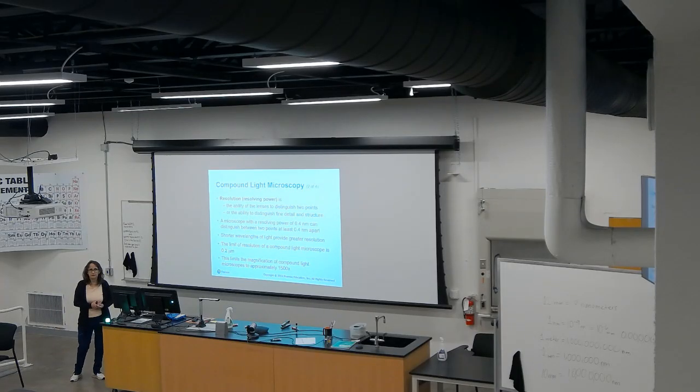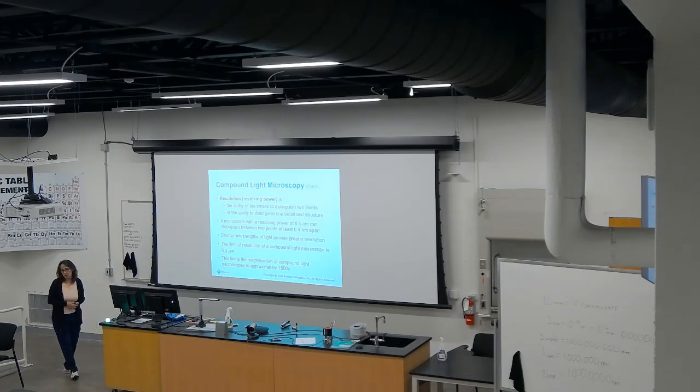So microscopes have something that is called the resolution or resolving power, which is basically the property of how sharp the image is going to be depending on the quality of the microscope, specifically the lenses.